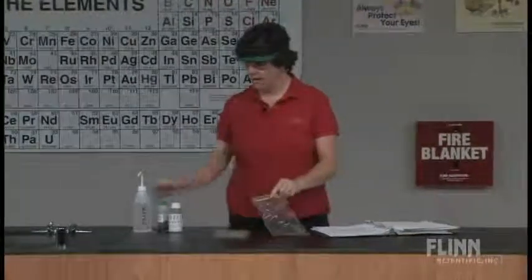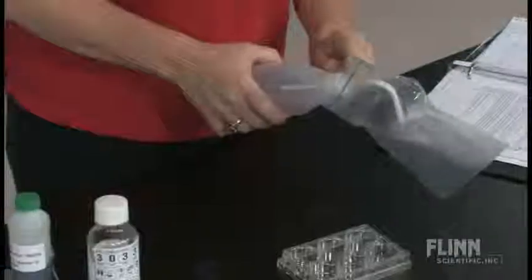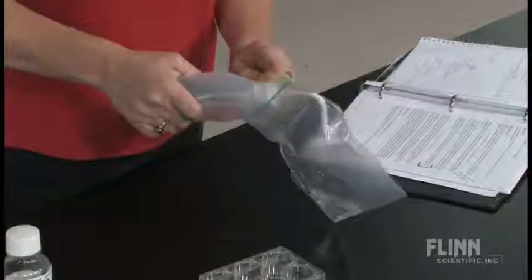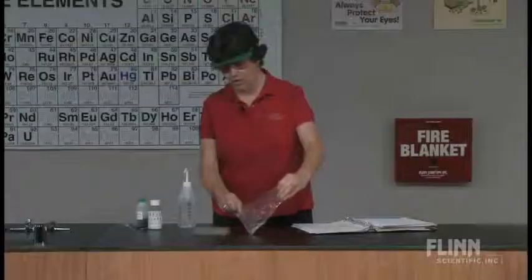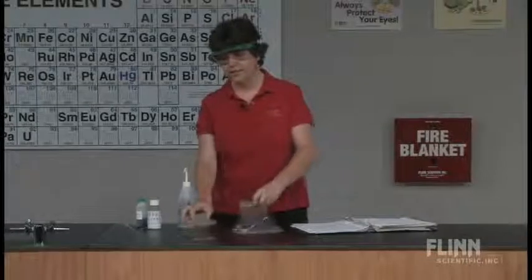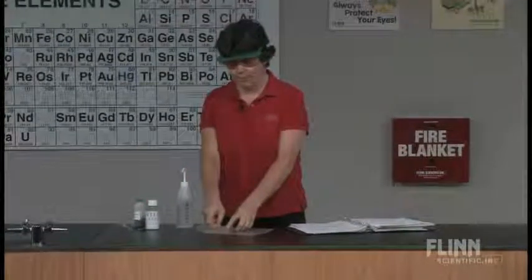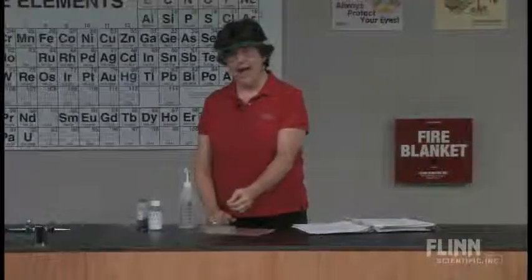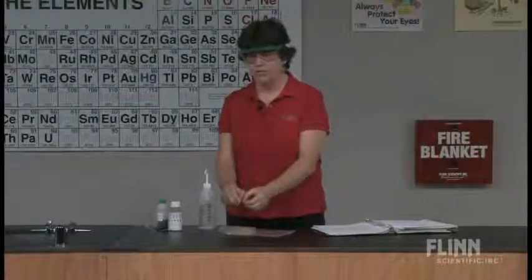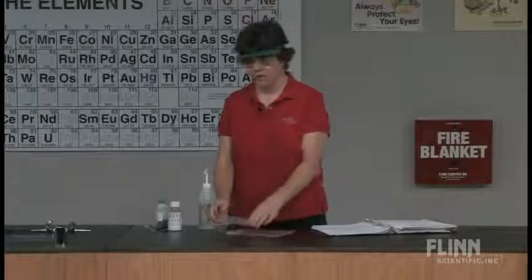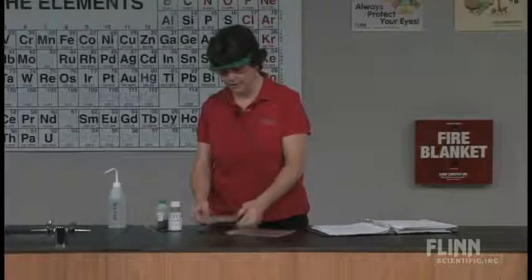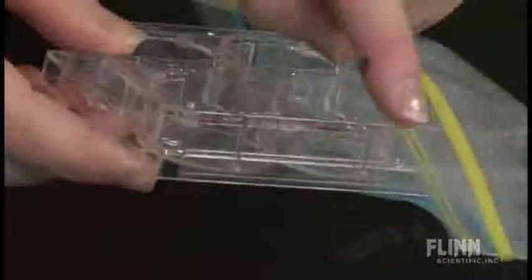In the baggie, I'm going to start by just putting some water in the corner of the baggie. When I put this dish into the water, I don't want the water to get into the dish. In one of the wells of the dish, I just have a little piece of copper metal, and I have sandpapered it to make sure I get the oxidation off. If you don't, it will still work, it'll just take a long time.